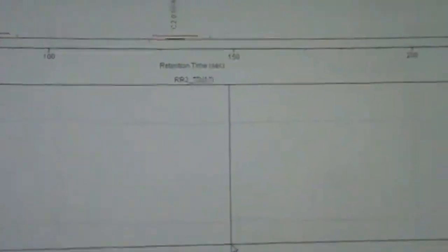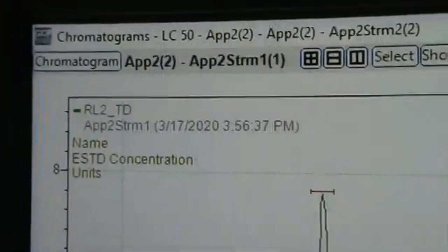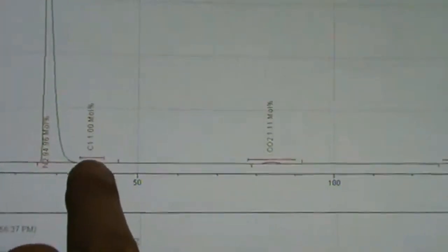Get rid of that. And that leaves us with our two main detectors of RR2, RL2, where in this case we are going to measure our light, measure this methane, which is a light, CO2 a light, and ethane, C2, which is a light, and then back flush everybody heavier. Who's heavier? C3, C4s, C5s, and then that C6 that was measured on the back flush. Now what do we do with our super lights on the bigs? We let the super lights fly through. Don't do anything with them, just let them fly through, and then separate out the bigs.